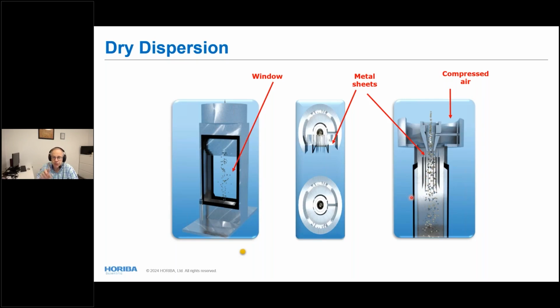And this really gets you 2 things. The first is that it keeps the windows clean. The particles don't go out to the windows, and that's really convenient because it means you can make multiple runs without having to worry about dirty windows.